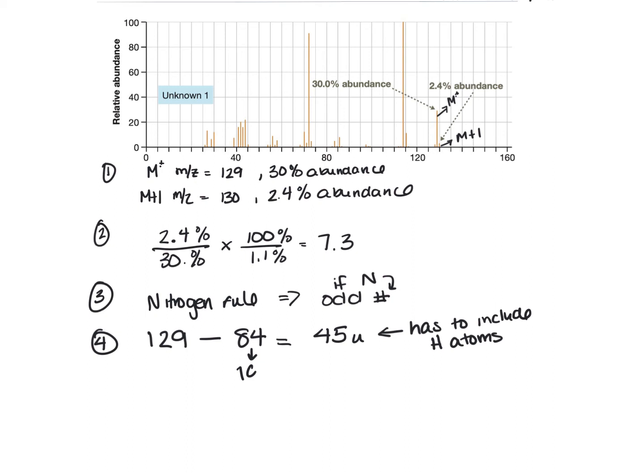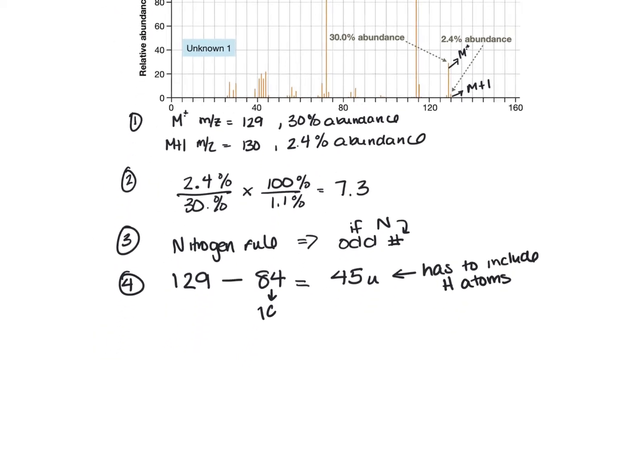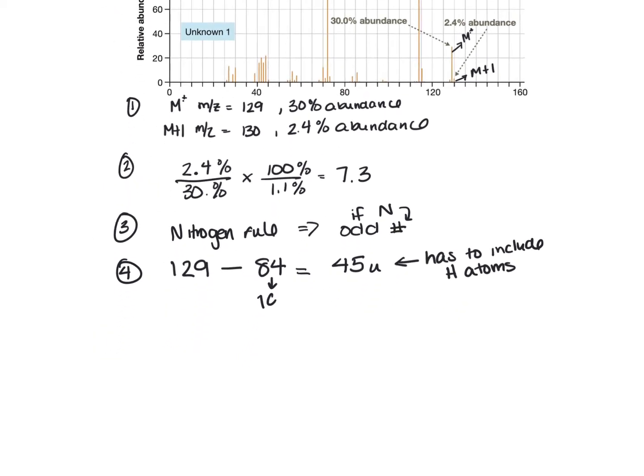It's more reasonable to assume that this would contain just one nitrogen atom. This is where we're making some assumptions, and where having other spectra is really helpful. For example, next week when we learn IR, it can give some clues about whether you would have a nitrogen.